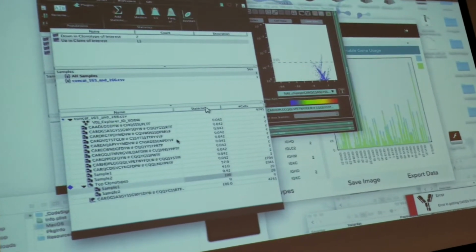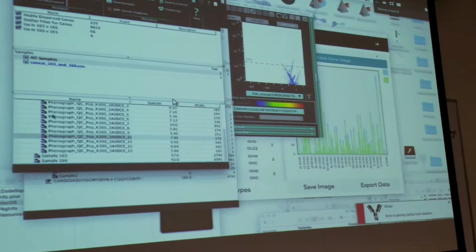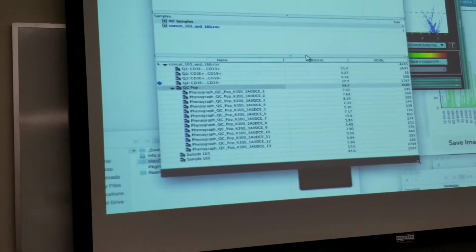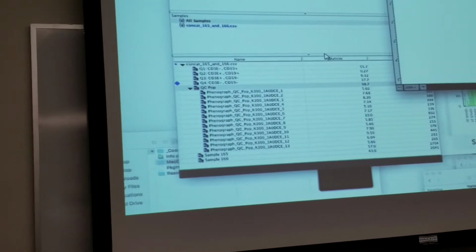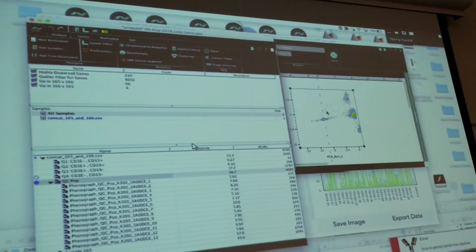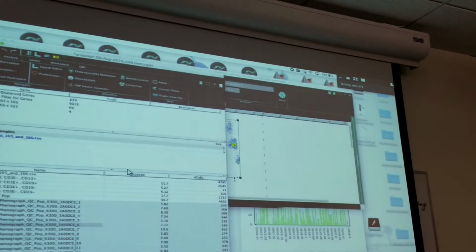Well, one thing I was thinking of is if you go back to a phenograph of one of the two populations. So go to the phenograph, and which person, 165, is the sick one? I would settle for a phenograph of 165 versus 166, and find what you consider an interesting population in 165 that's not in 166, and then we'll look at what those parameters are, and then what V regions are in the cells in that population. Something like that would be acceptable.